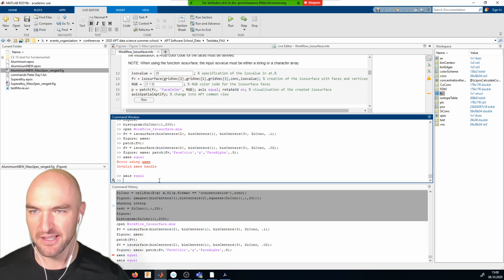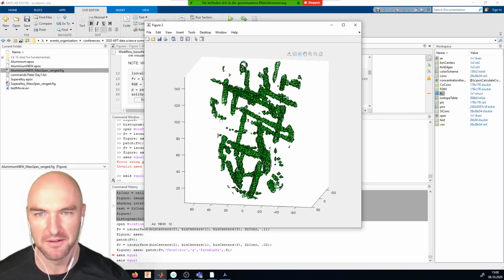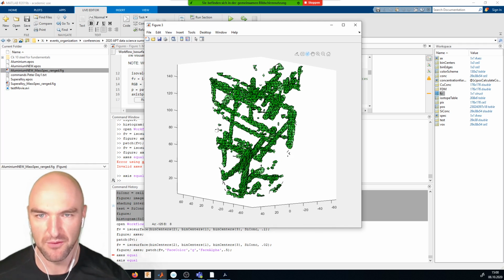So we have a convenience function that, if you have any kind of 3D plot and you have it upside down and maybe the coloring is not there and everything, is a very quick function that can fix that for you.